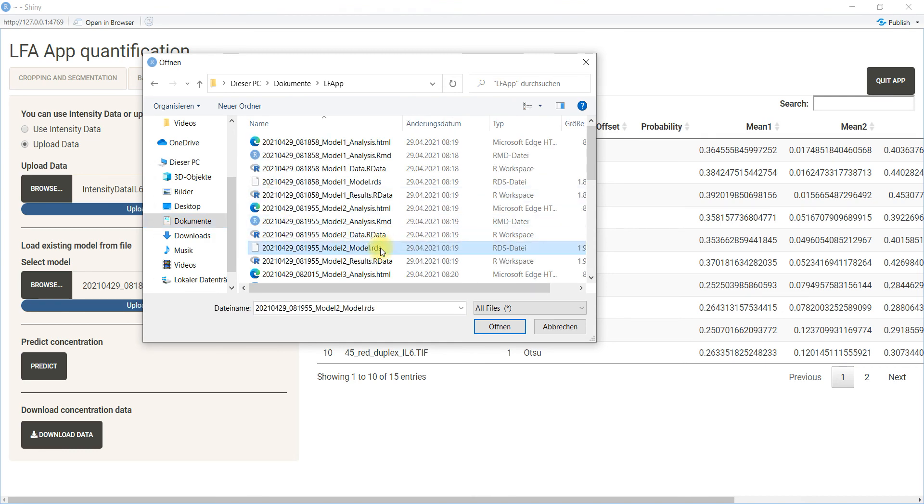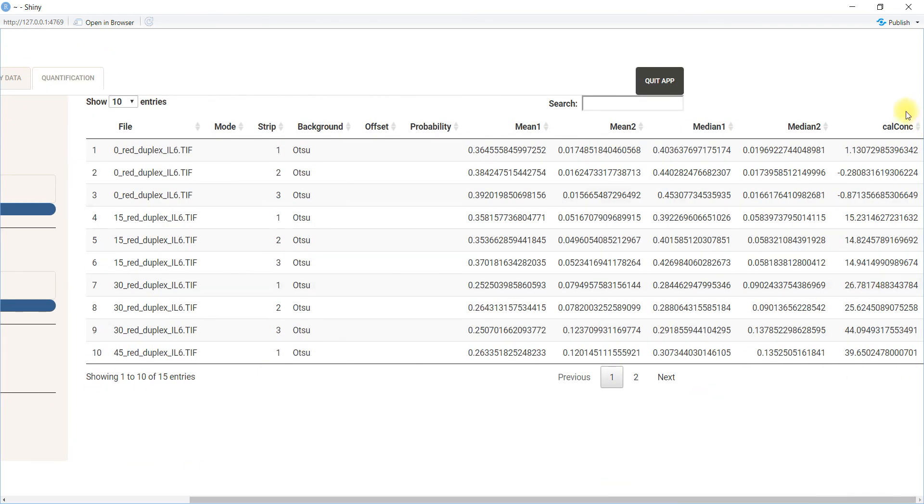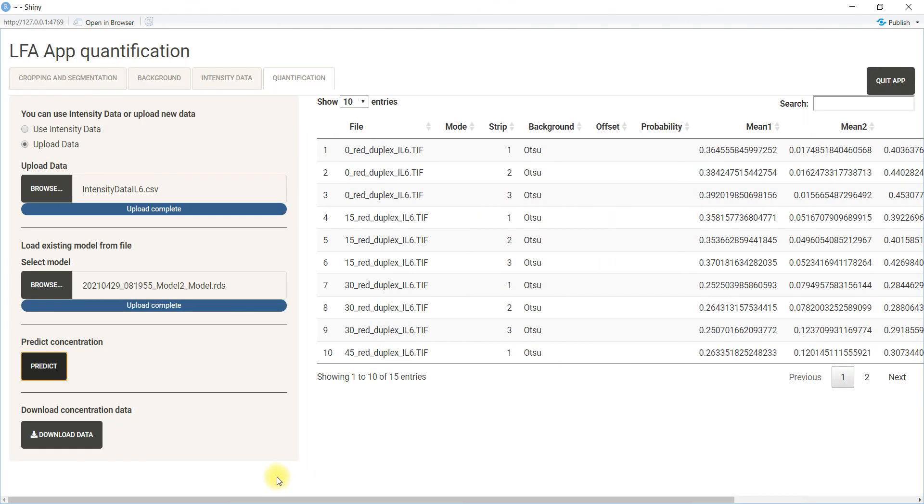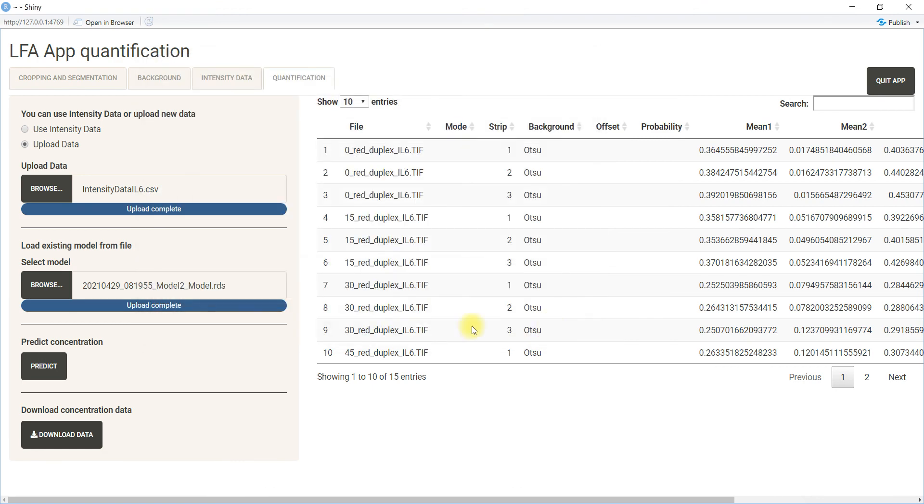Same with model two. Perform the predictions—the calculated concentrations here, so the previous numbers are overwritten in this case—and you can again download this dataset and have it as results for model two, and so on.